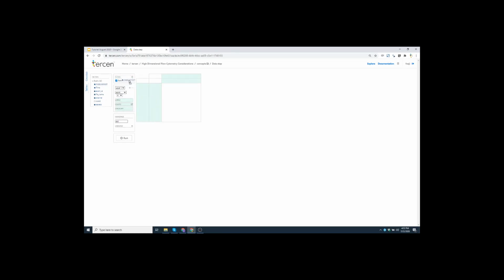And once I click on it, you see it goes green. That means I can drop it where I'd like to. And I can drop it either as a filter, a label, a color, an error bar, a row concept, a y-axis concept, an x-axis concept, or a column concept. So I'm going to put it as a y-axis concept because that's where I want the data to be drawn. It puts all the measurements from all the channels in this cell. You see it's multiple, and it automatically orders it from lowest to highest.